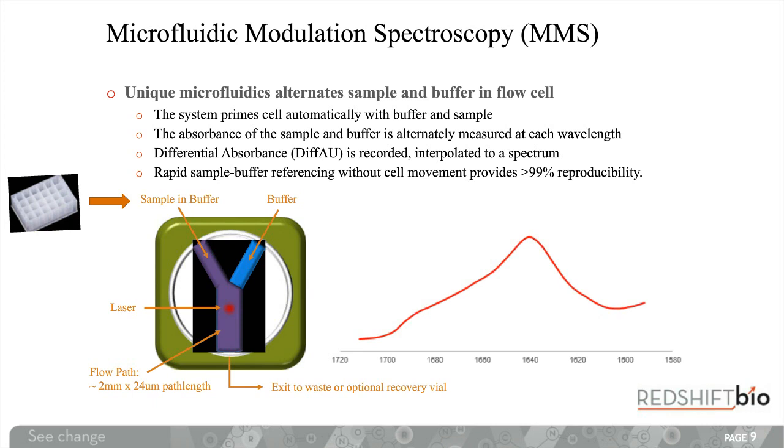This is actually why the technology is called microfluidic modulation spectroscopy, as we are using a microfluidic flow cell and modulating the inputs between these two channels. And this gives several inherent advantages over FTIR. The first of which I've already touched on, being that by using this one microfluidic flow cell, we are effectively getting perfect cell matching, which is a problem with FTIR.